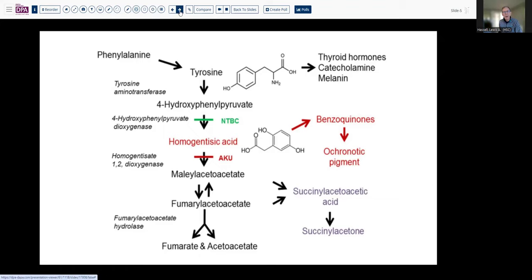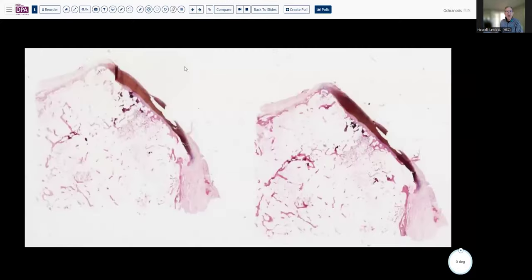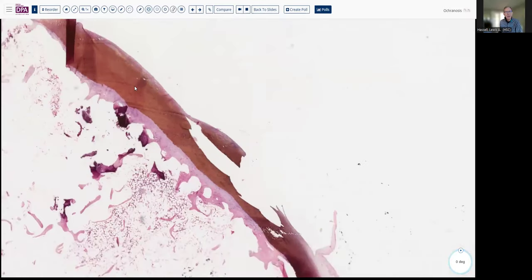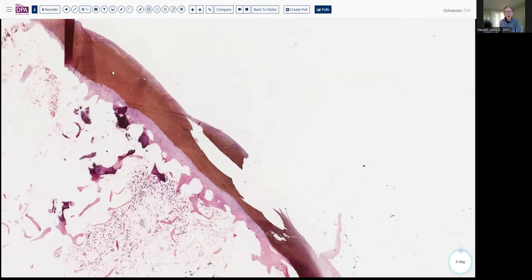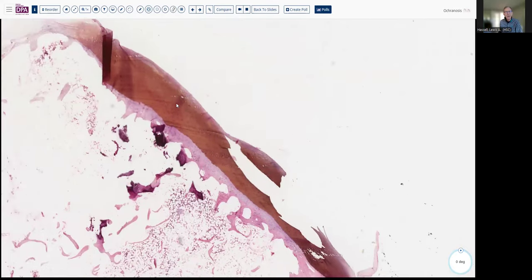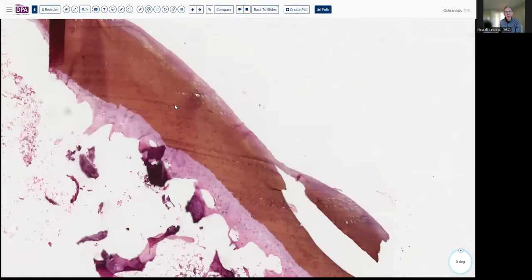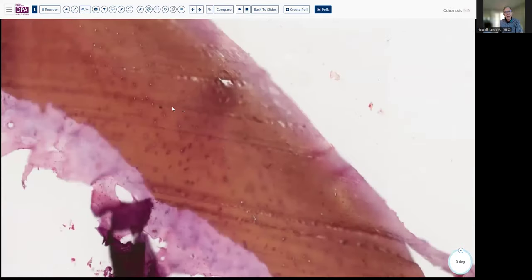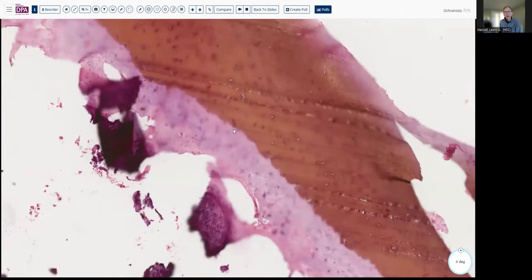When we received the joint replacement sample, we should not be surprised to discover that there was this accumulation of pigmentation in the chondroid tissues. That's represented here with this very distinctive reddish-brown color in the cartilage, not the usual blue myxoid tissues that we would associate with articular cartilage.